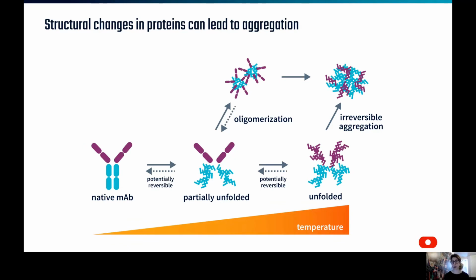So proteins form three-dimensional structures, each with their own characteristic properties such as size, molecular weight, preferential folds, etc. And as proteins interact with other molecules in their environment, these properties can change, which directly affects their functionality and stability. In particular, the changes in their structure or folding can lead to changes in their size and can induce protein polymerization. As with most things in life, there are pros and cons to these changes. So either the biomolecular machinery carries out its intended function and our cells, and essentially we as humans, continue to exist, or the misfolding of these molecules induces disease-related aggregates, which we must combat with therapeutic strategies.